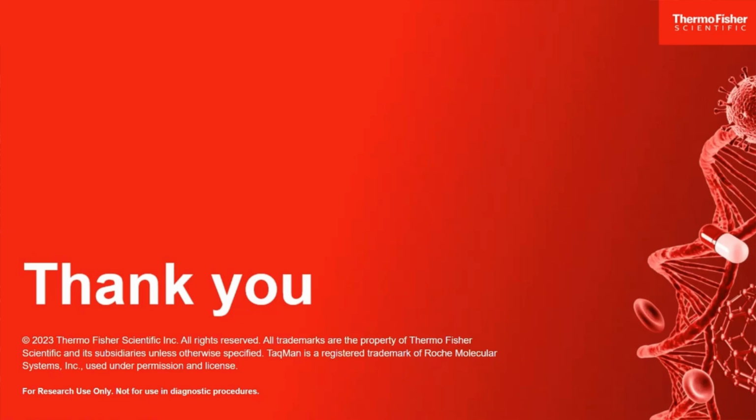If the custom dye calibration was accurate to the dye that's on the probe, we should not see a response. And if it's not accurate, then you may see a response. That means that the custom dye that was used in the calibration versus the dye that's actually on the probe, those spectral signatures are not a good match. And so that's going to be an issue that needs to be addressed.